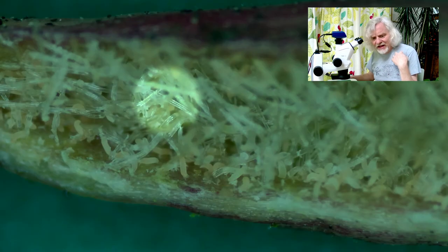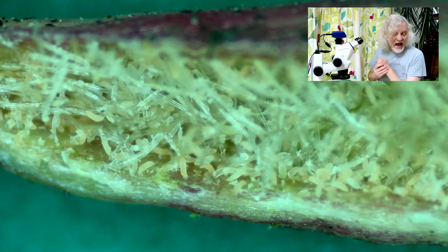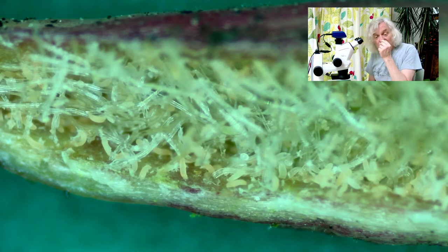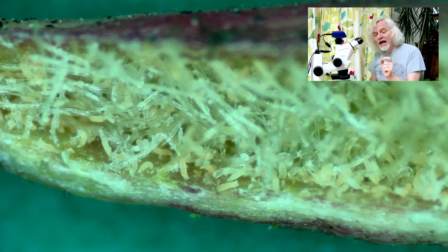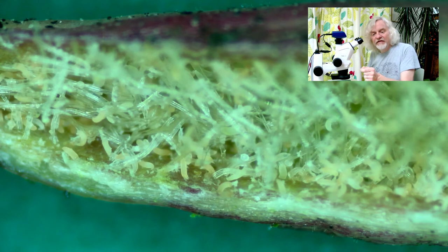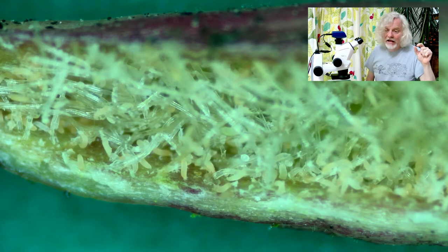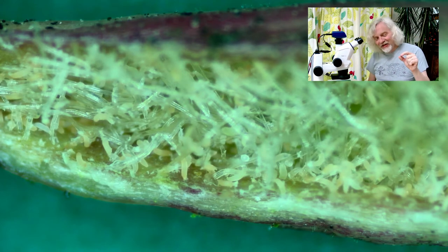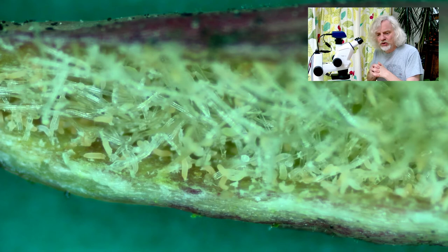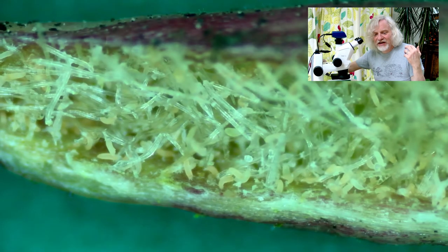Now, the long strands you can see — the hair-like things — that's part of the plant. The creature that makes this is called Eriophyes tiliae. The fact that it's called tiliae gives you a clue that it's only on lime tree. These are the lime nail gall mites. They make these lime nail galls. They only live on lime trees and they only live on particular species of lime trees. So you have different lime nail gall mites on different types of lime tree, because there are lots of different species of lime tree. I haven't worked out which species this was because I literally just grabbed it, but you can see the whole thing is absolutely teeming with them.